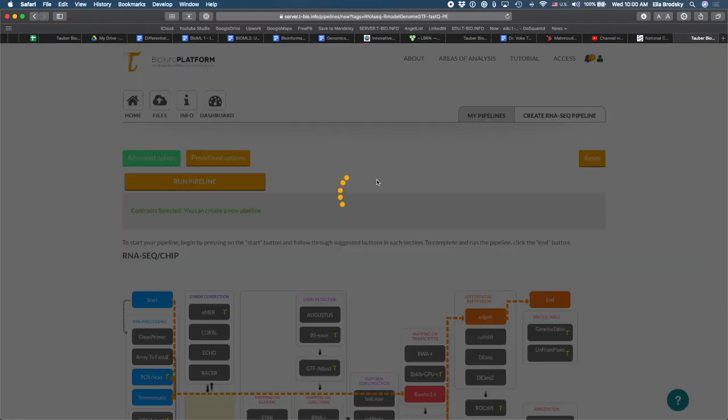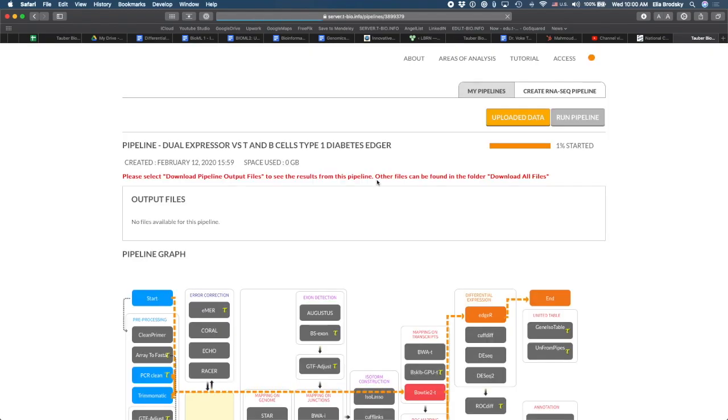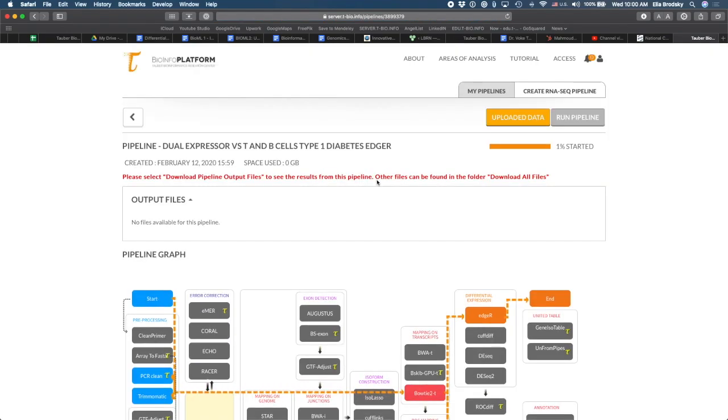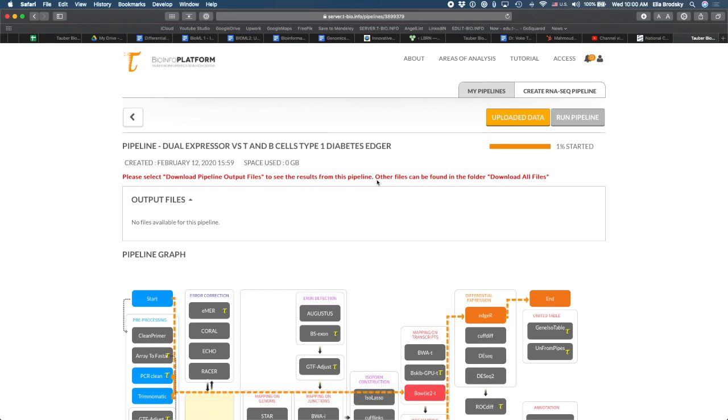Now when this pipeline finishes running, you will see that the files have been uploaded directly from NCBI, from the SRA archive and directly uploaded on the platform and also saved under your account so you can use them later on. That's it for today. And thanks again for checking in.